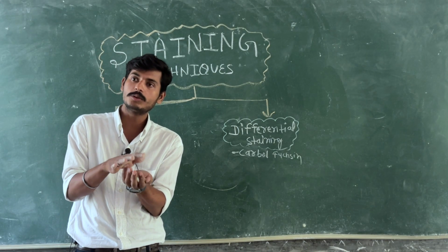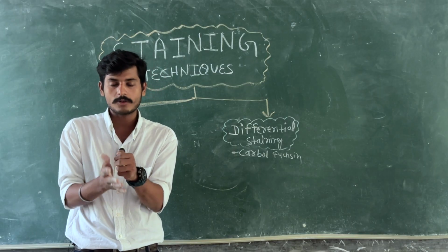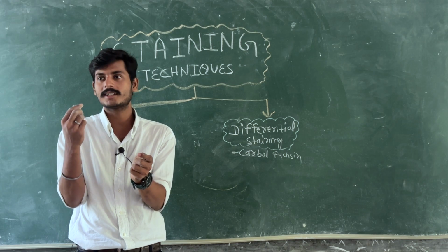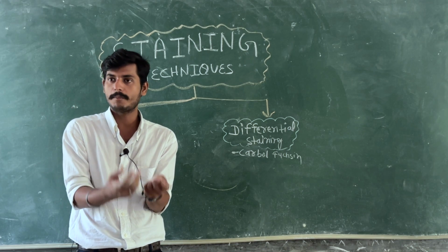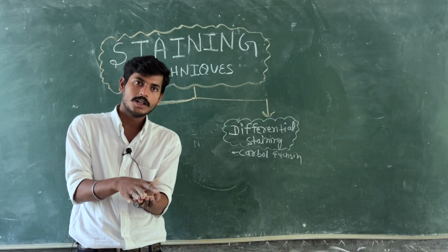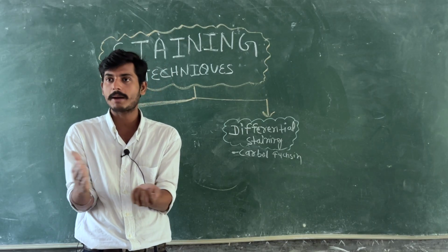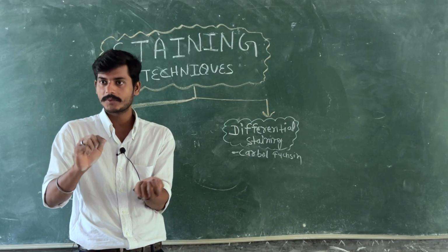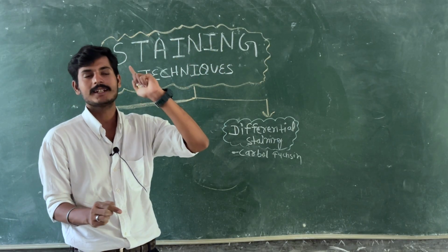वो बैकग्राउंड के साथ ही मिल जाएगा. तुम डिफरेंशिएट नहीं कर पाओगे कि व्हाट इज द बैक्टीरिया एंड व्हिच इज द बैकग्राउंड. It will basically mix with the background. So in order to differentiate from the background, we are going to color the bacteria. So for coloring, we are using the staining technique.